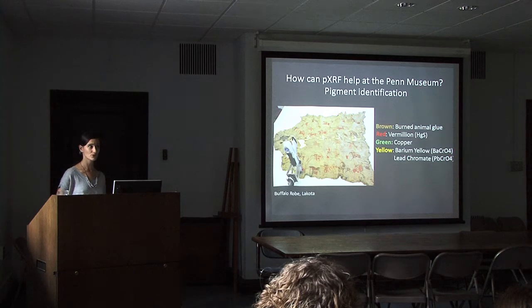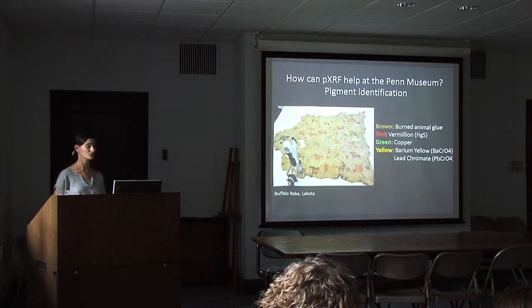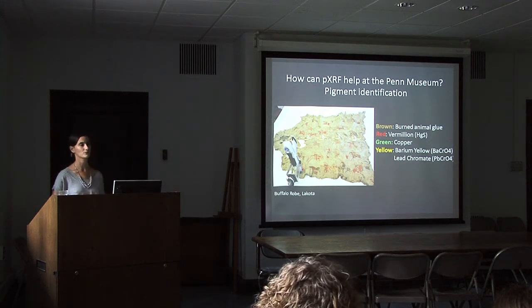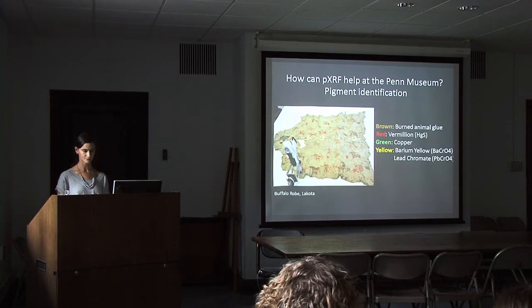Do we need to know more than that? That's a really good question. If we do, then we can look to other analytical techniques to pinpoint the crystal structure and then identify, yes, is it barium yellow, or is it chrome yellow, or some combination thereof.